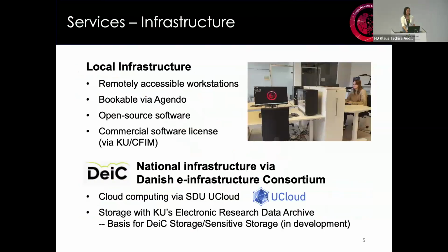Infrastructure: you start a new facility, the first thing you do is go out and buy some machines. We started out with 3 workstations that we put online and made publicly bookable and remotely accessible, because like I said, we are also trying to serve users from across Denmark.